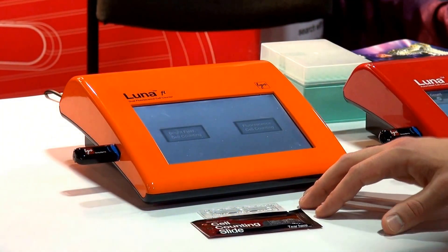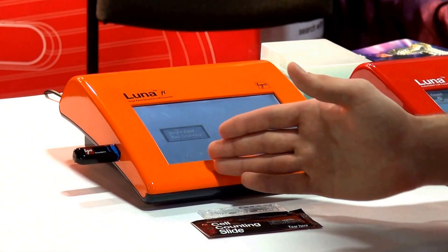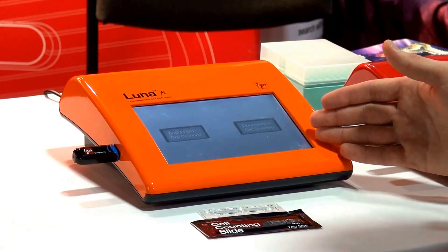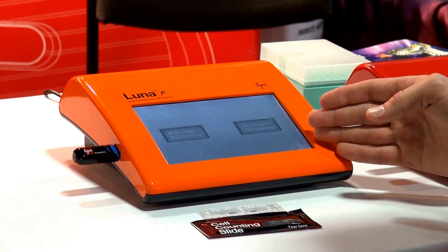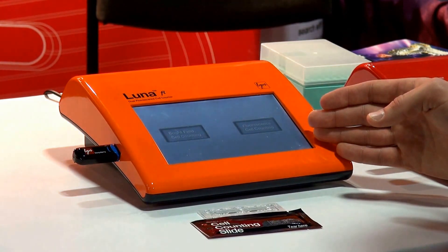When you turn on the Luna, you will have the initial option to choose between bright field counting and fluorescence counting. The bright field option is for your Trypan staining, and the fluorescence counting is for AO and PI fluorescence staining.